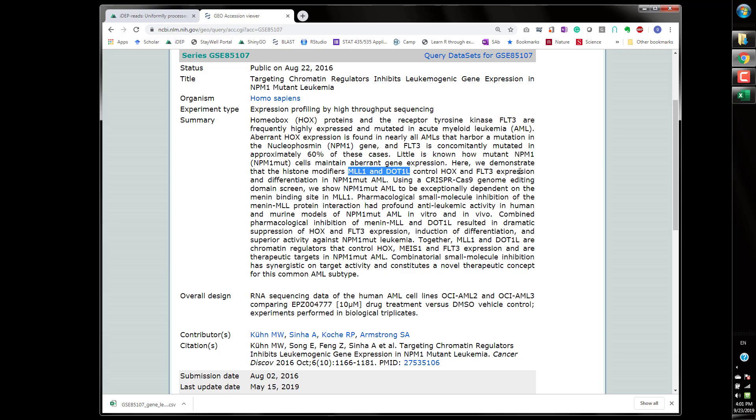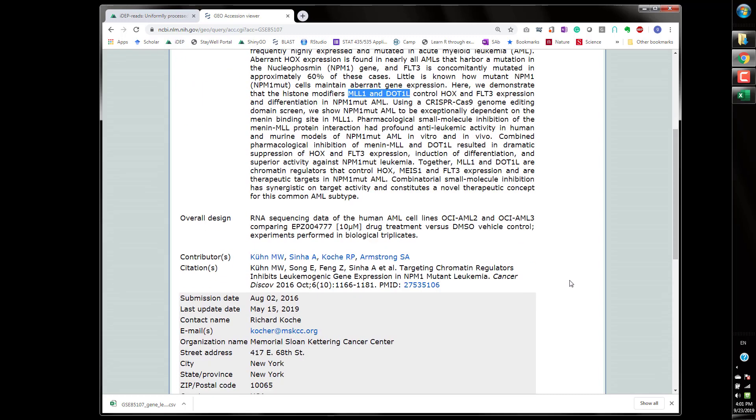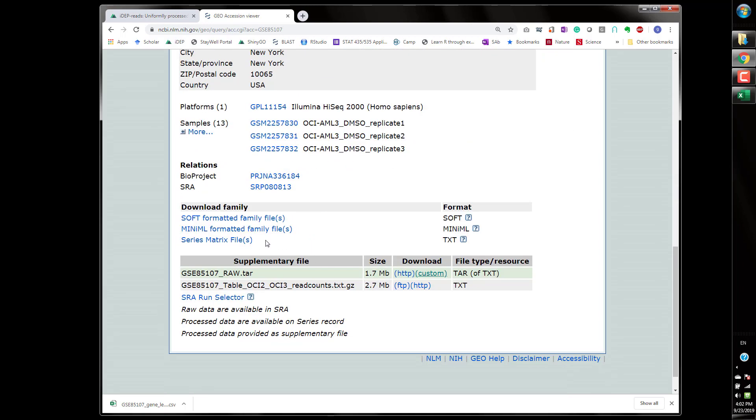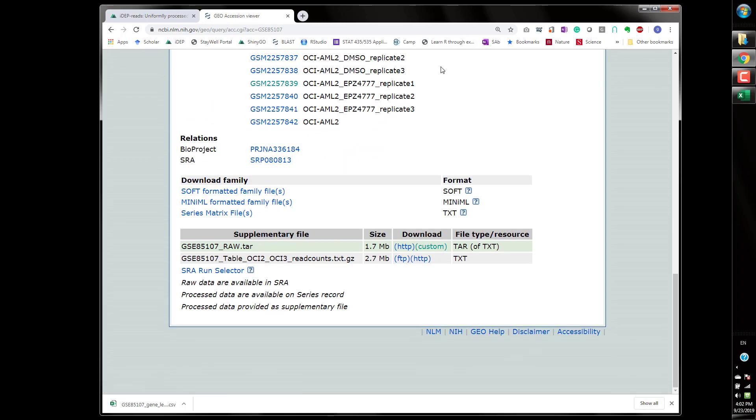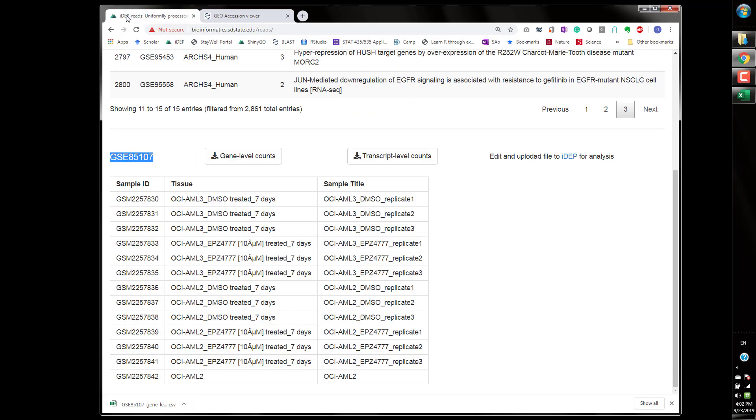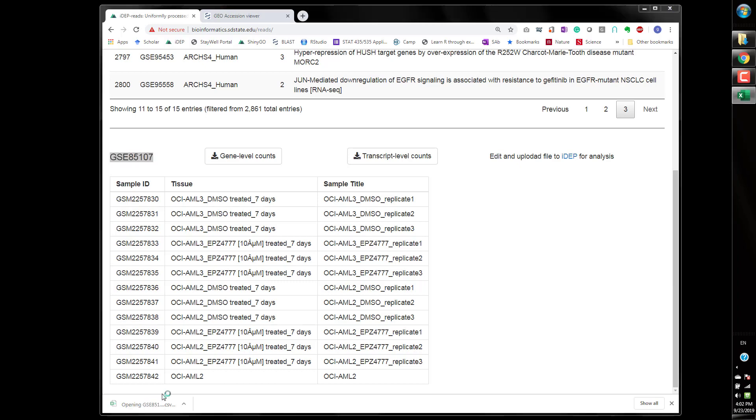So they are trying to examine whether by blocking chromatin histone modifiers could be used to treat cancer. So 13 samples here and they also have their own read counts data here which we'll use in a little bit. Now go back to this data that we just downloaded.